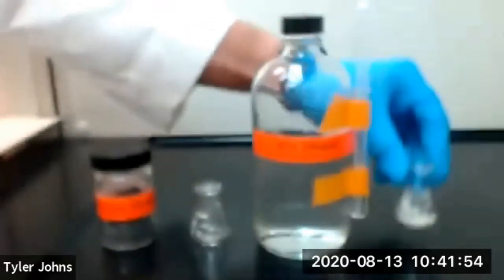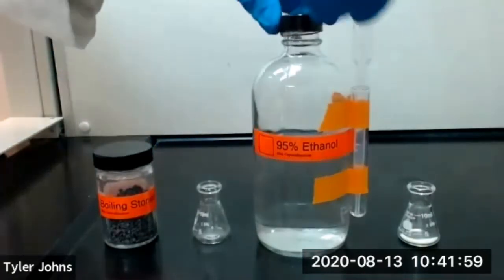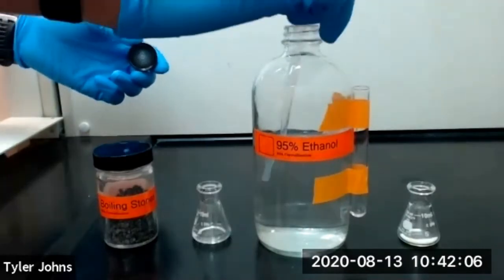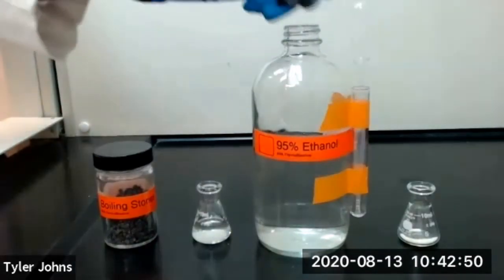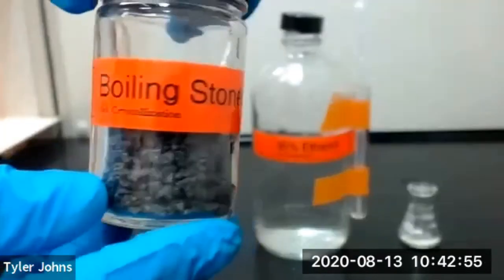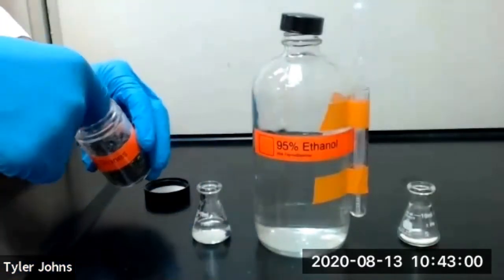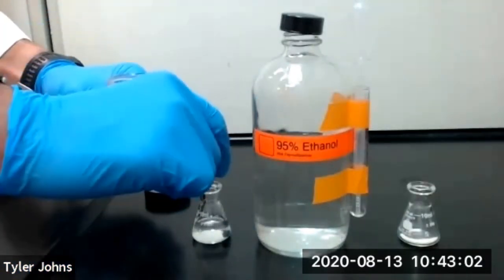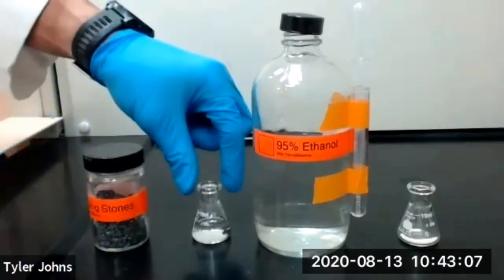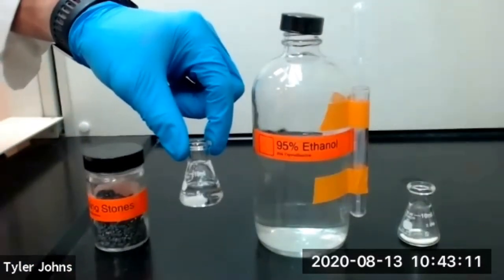We've added our sulfanilamide to a 10 milliliter Erlenmeyer flask. We'll now add 6 milliliters of 95% ethanol to another 10 milliliter Erlenmeyer flask, along with a boiling stone, and bring the 95% ethanol to a boil on a warm hot plate.